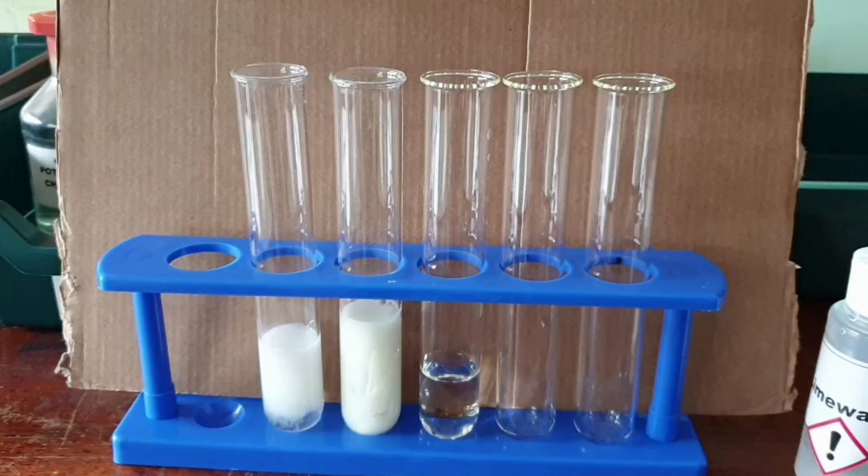So when I add silver nitrate and nitric acid to the first one, it makes silver chloride, which is insoluble, a white precipitate. When I add silver nitrate and nitric acid to the second one, it makes silver bromide, which is a cream precipitate. And then that's where this video picks up. So it's the difference between chloride gives a white precipitate, bromide gives a cream precipitate, and then iodide you'll have to watch.